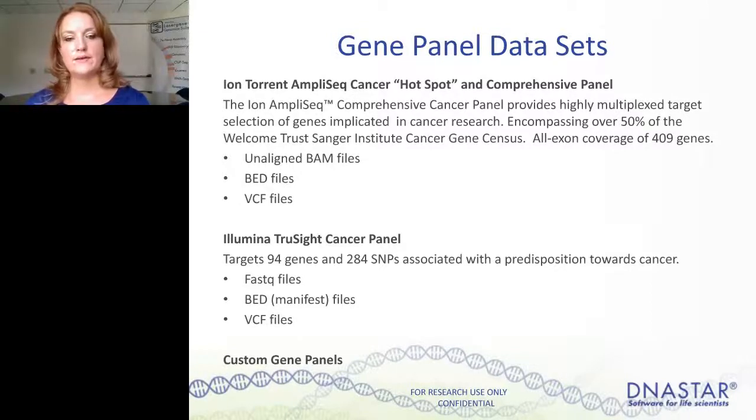And then if you're working with a custom gene panel, you might not have these types of files. You might be maintaining your targeted regions or your annotations in a spreadsheet. And I'll talk a little bit about how you can bring those in as well.